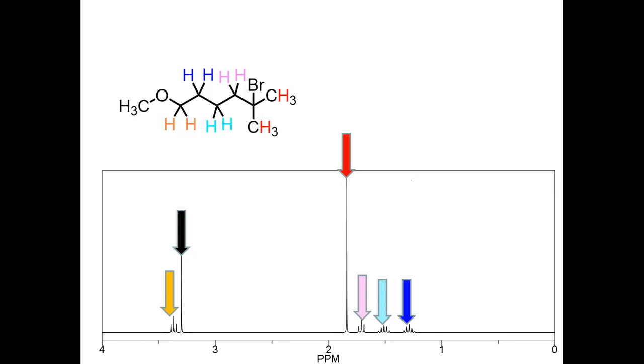Let's look at the other one that's a singlet. It's the red protons right here. If you look at this carbon, are there any hydrogens here? This gives us a chance to answer another question too, because somebody is thinking that this shouldn't be a singlet because of these 3 protons over here. But if you look at the structure, there's a carbon between those 2 carbons, so they're not going to split with one another.